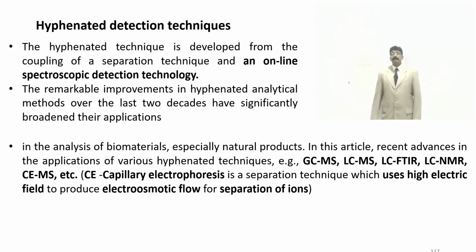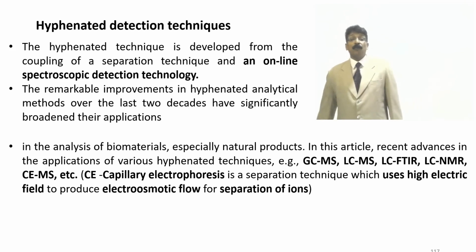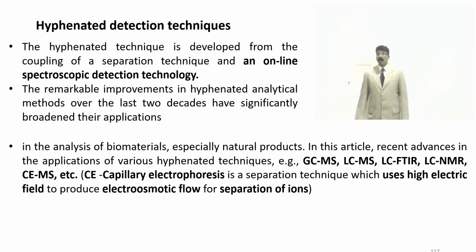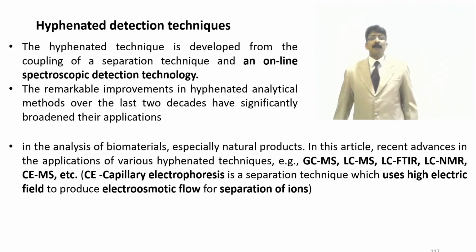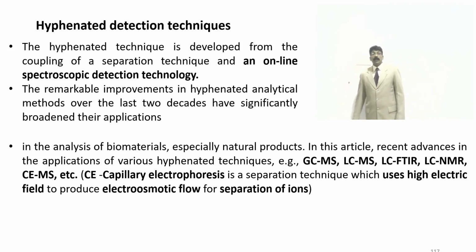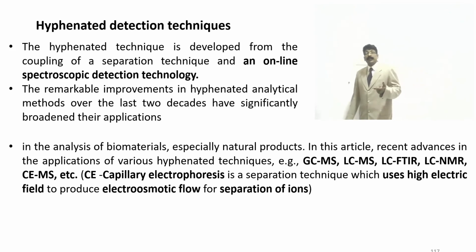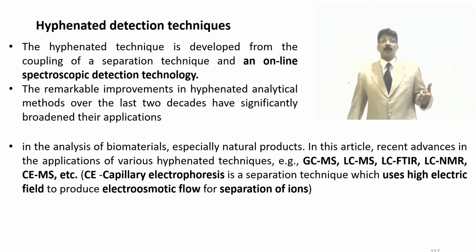So it is very important for you to know the meaning of hyphenated detection technique. You should write very clearly that a hyphenated detection technique is a technique developed for coupling two types of instruments, or separation techniques, online, or coupling of two technologies in the same analysis. That is why it is called hyphenated detection.